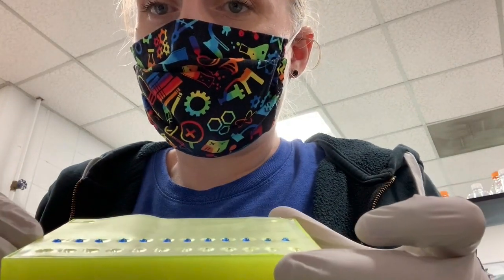Okay. After you've added your nuclease-free water to your second row, you're going to add 1 microliter of the formaldehyde loading dye into each little droplet. And I sort of estimate this. I load up a tip with 10 microliters, and then I add this to each. It's actually probably more like a microliter and a half. Okay. So you just want them to be blue. They're going to look a little green on here because I have a yellow rack.